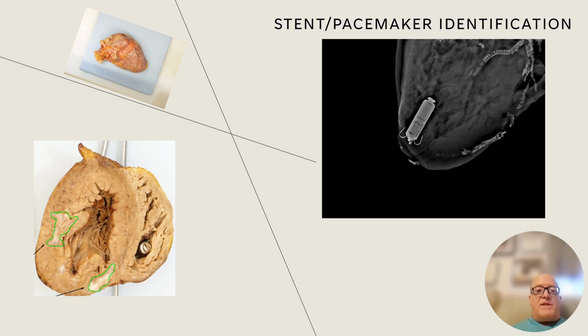Now, I've never seen one of these before, but this is actually a pacemaker within the myocardium of the heart. I've never seen one before, and I just happened to x-ray this heart and say, hey, look at this, and I was able to identify that as well. I didn't expect to have it there.